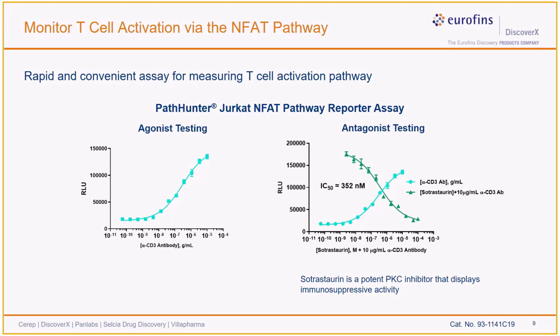The data on the right demonstrates the assay in antagonist mode, where a small molecule inhibitor of protein kinase C was used to inhibit the signaling pathway occurring downstream of T cell receptor activation, and thus inhibiting NFAT reporter gene expression.